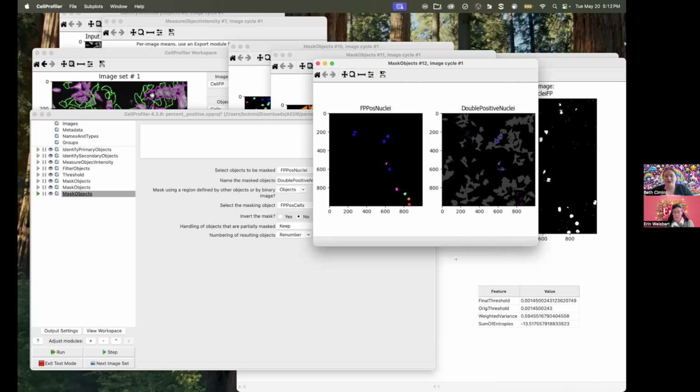So for all the questions that we get about this, it's really just a matter of knowing the right tricks, and then you're usually in really good shape. That's awesome. I wouldn't even have necessarily thought or known to assemble these widgets, aka modules, in this exact manner. This is lovely, Beth. Thank you.